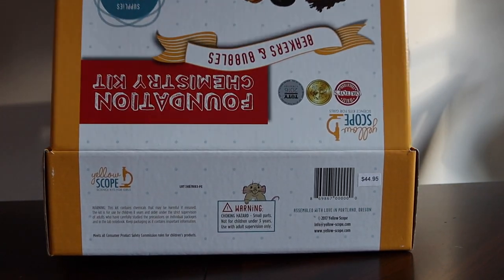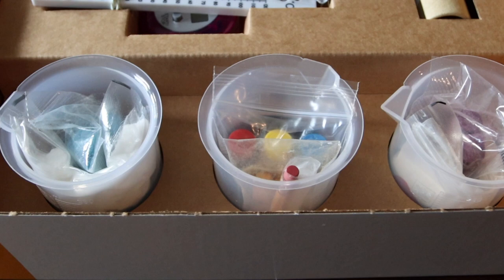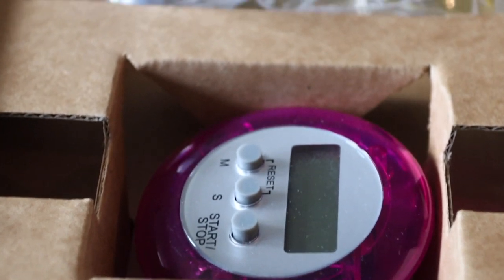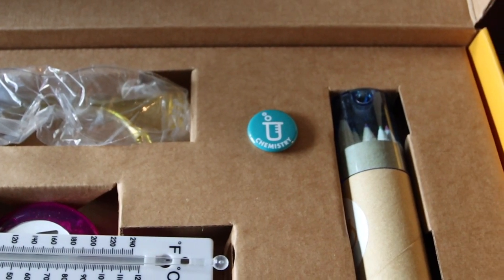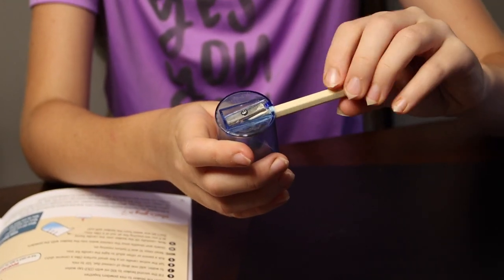Let's get into this kit. The first thing you'll notice is the quality of the products they provide. You get three good beakers, a thermometer, a stopwatch, and safety goggles of course. A nice chemistry button is an additional touch, along with some colored pencils whose top also doubles as a pencil sharpener — a nice touch.